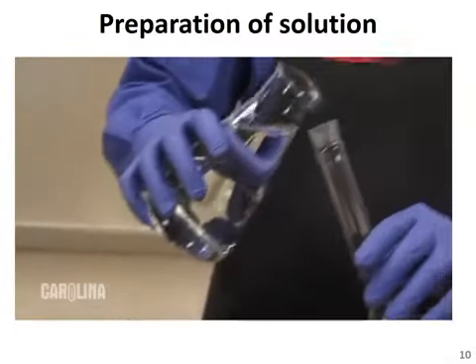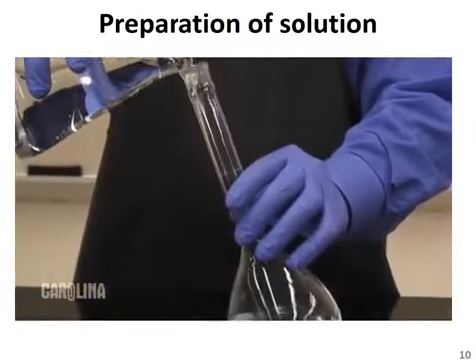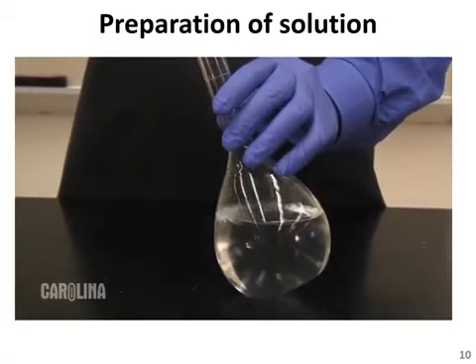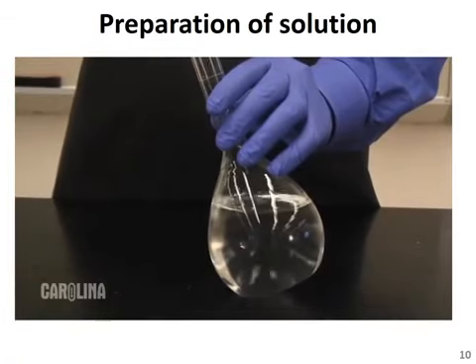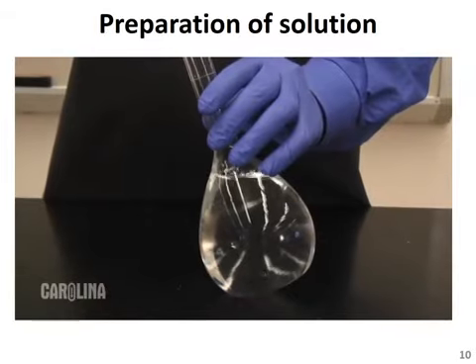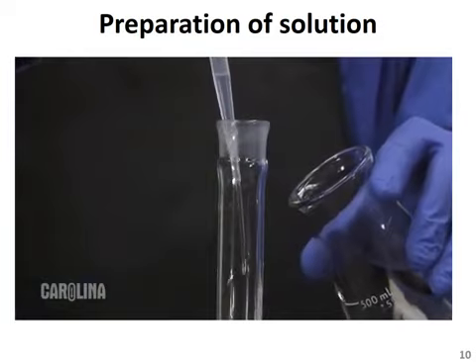Now that the sodium chloride is completely dissolved, we can fill the rest of the bulb area and some of the neck with water. You should now carefully and slowly add water, our solvent, as it begins to fill the neck. Once you approach the etched or printed line on the neck of the flask, you should add solvent dropwise, monitoring the location of the meniscus.